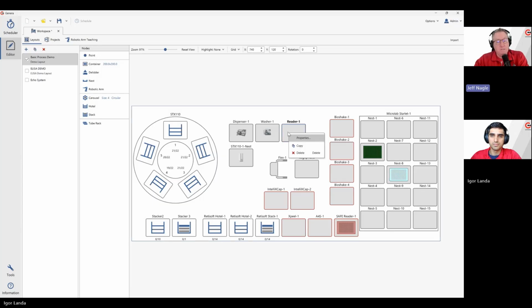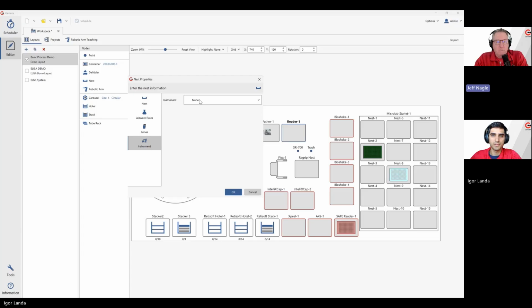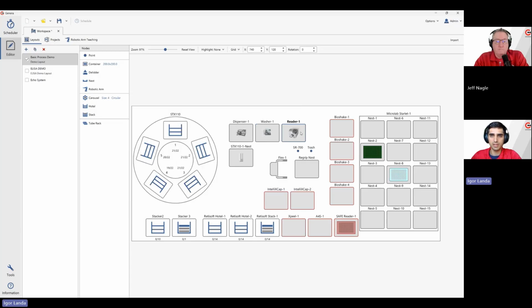And if the association isn't there, those instruments don't come along. But he could go back in and install the instrument package, then put the instrument in, and then make the connection to those workspace nodes there. Like, for example, for this reader-1, I didn't have the reader that the original workspace had, but let's say in this case, I have the Synergy Neo 1, and I could import it, and now you can see it's not red anymore. Perfect.